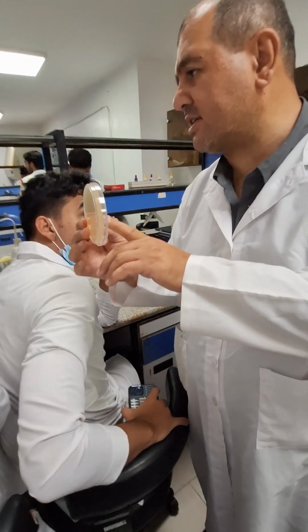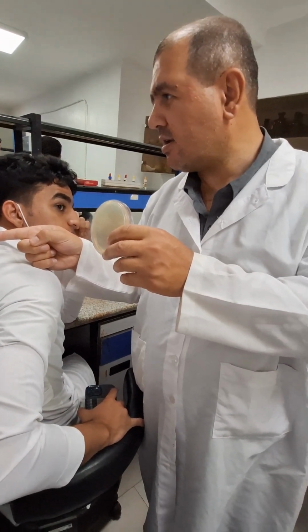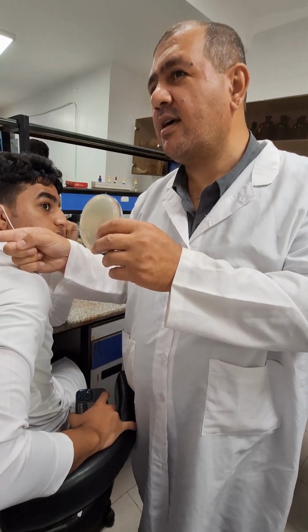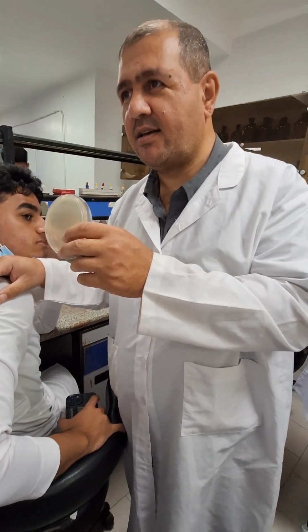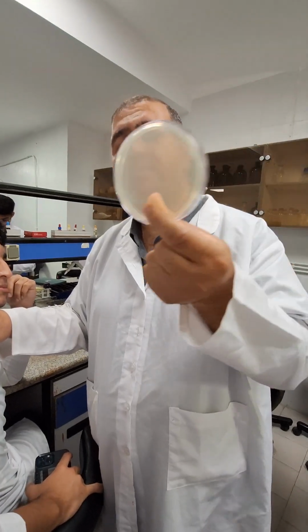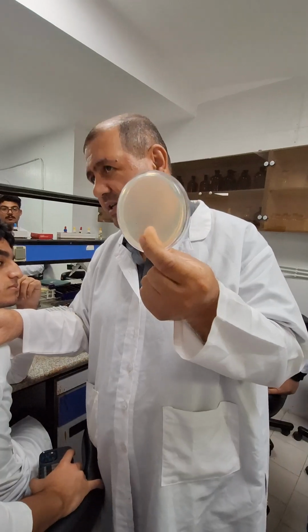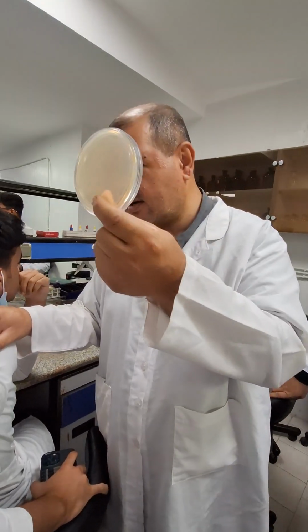The name of the media: nutrient agar. What is nutrient agar? It's used to culture. It's a basic media, used to culture non-fastidious bacteria, such as E. coli, Staph aureus, okay? Basic media.